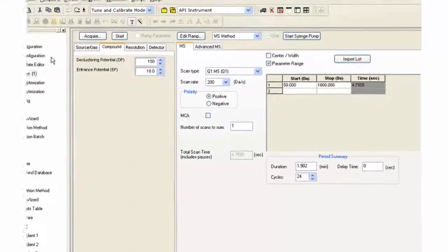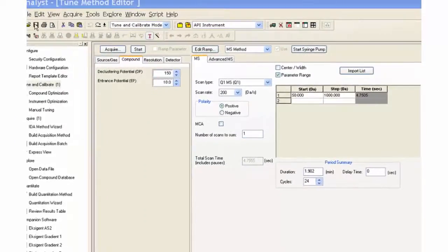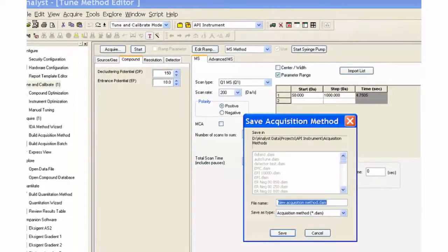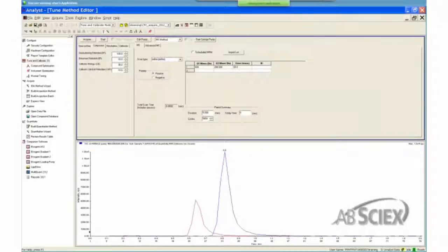Click on the Save button and name the acquisition method. Once a method has been created and modified, it needs to be saved.